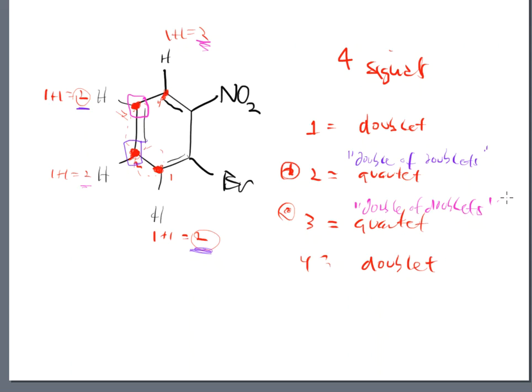And now I also know that those carbons are coming to me in forms of 2 and 2, which means 1 hydrogen on one side and 1 hydrogen on the other. All right, so this chemical structure, 4 chemical shifts, 2 of which are doublets, and 2 of which are double of doublets. That is the way that we would answer that question.